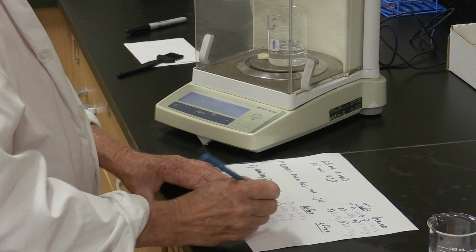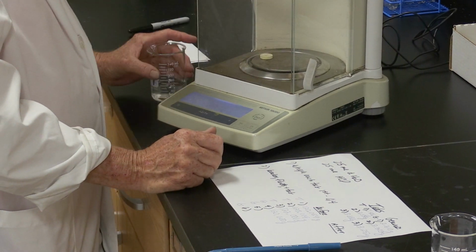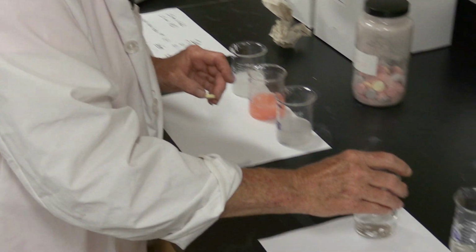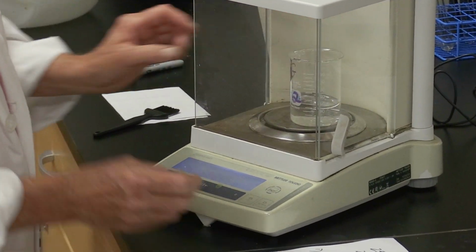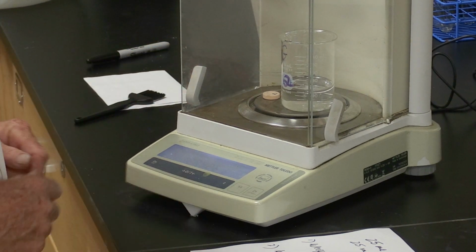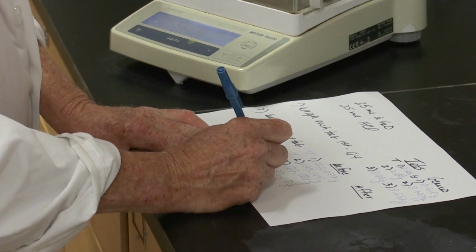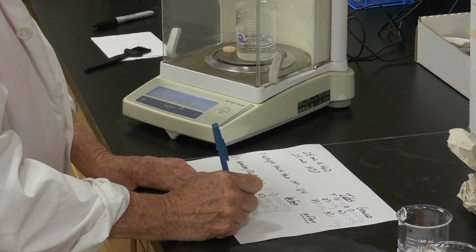120.600 grams for the first generic. Drop the tablet in. The second one, 120.426 grams.